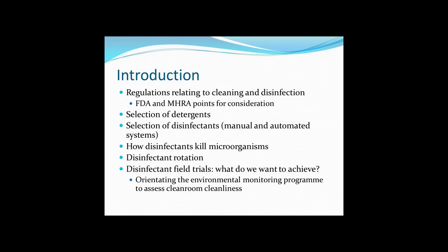We'll also have a look at one aspect of disinfectant qualification, which is the field trial, and consider what we want to achieve. And we'll also have a look at some of the key audit points relating to cleaning and disinfection. And some of these are drawn from recent FDA warning letters.